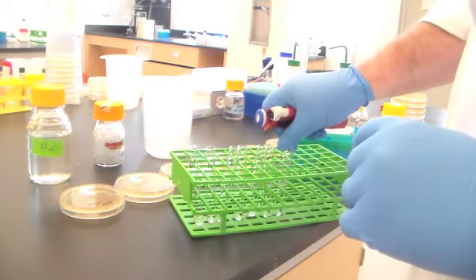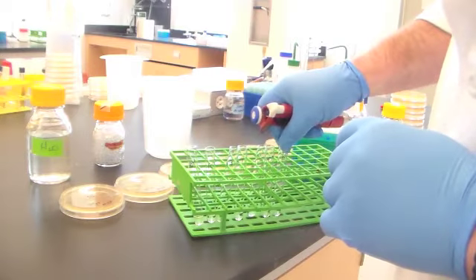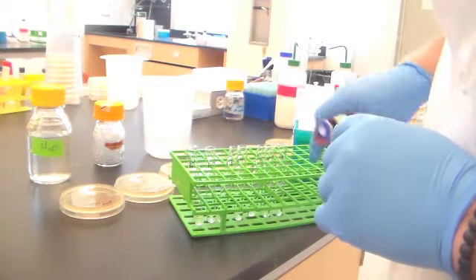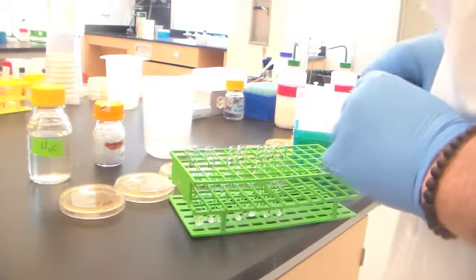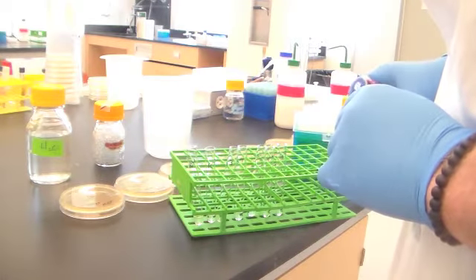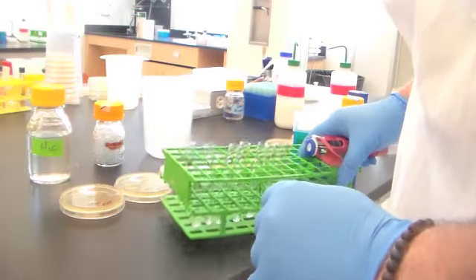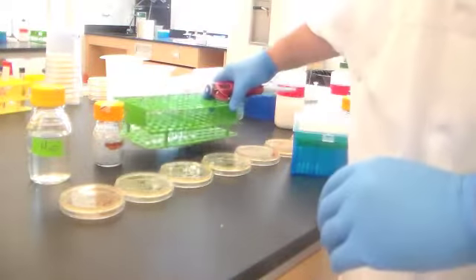It's really not critical for the type of counting that we're doing now that I took that last 100 microliters out. If we were counting the total number of bacteria in these mills, then that last extraction would have been important. But in this particular case, it isn't. But just for good practice, throw away 100 microliters from that. So now, I'm going to set these aside for just a minute.